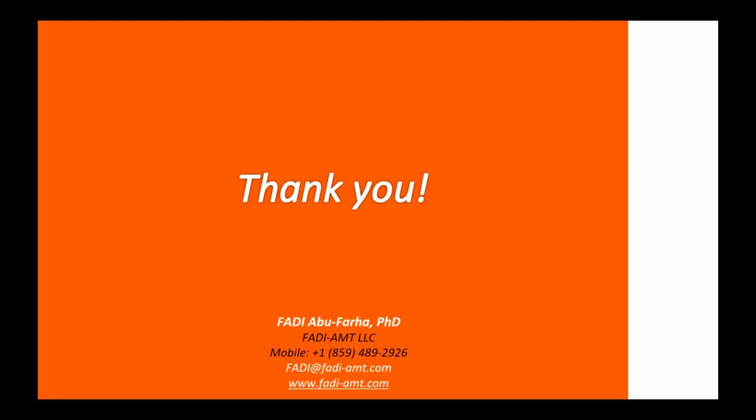I just wanted to also mention something else related to this question. In regards to reference images and lengths, this is something maybe I did not mention in my slides today, that for every system, whether it's a 2D or 3D DIC system, we usually take a reference image with a known scale, and we use that for generating all the data that was shown here. So I omitted to show this earlier in my slides, but just to confirm it, we do take a reference image with a reference length that is known, and we use this in the computation of the different extensometers.